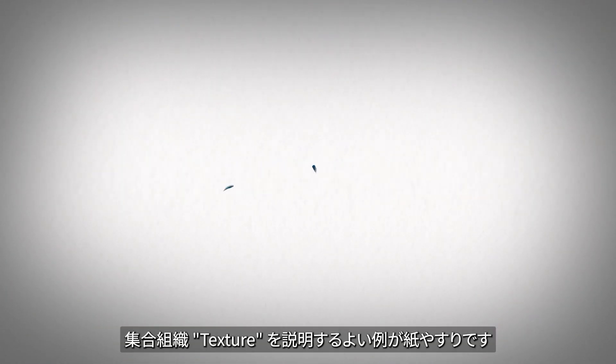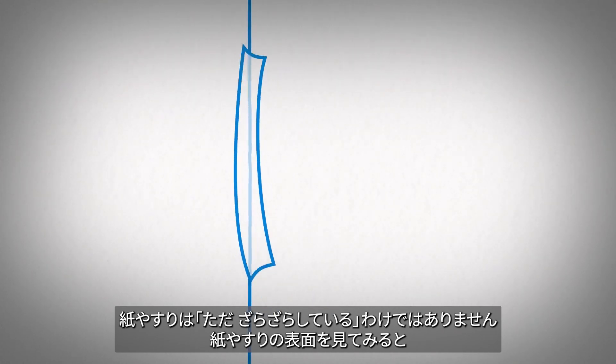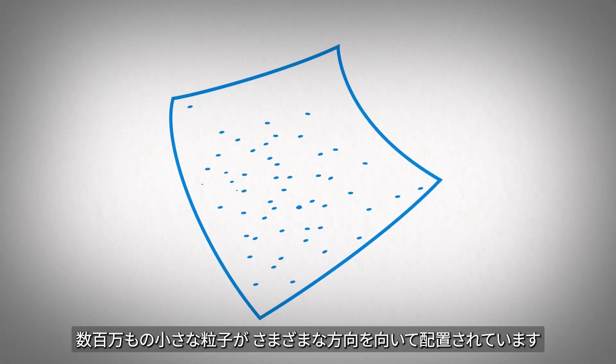A great example of texture is sandpaper. Not in that it feels rough, but rather if you look at the surface, it's made of millions of tiny particles that can be oriented in a wide variety of ways.